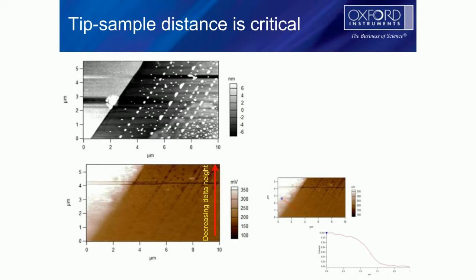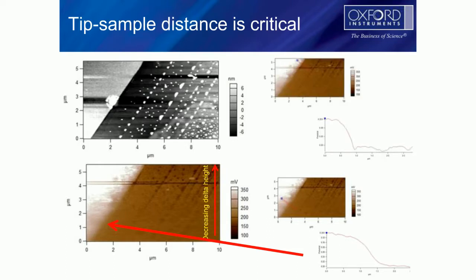But as we move further up, we found that the resolution dropped to roughly 500 nanometers. And look at the resolution of all the little bits and pieces on that. That's a much higher resolution. I think that's probably corrosion or contamination on the surface.